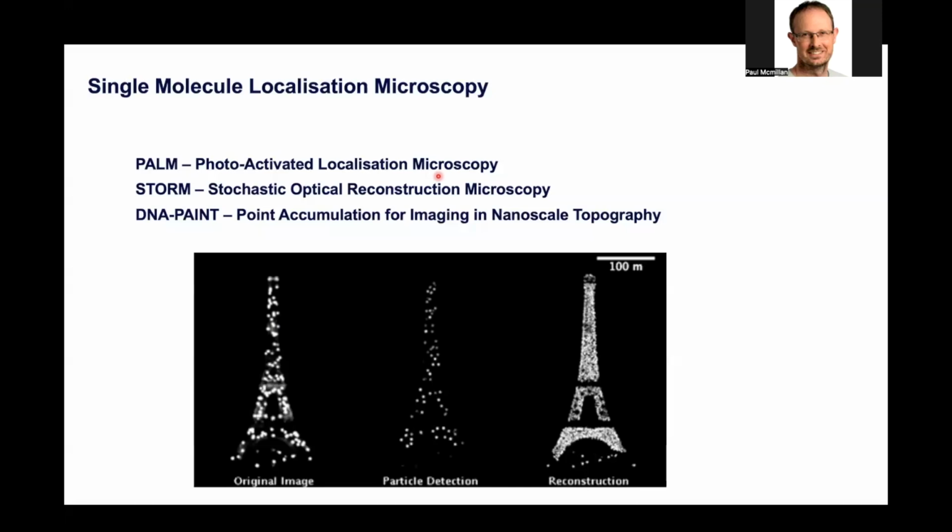In the case of photo switching, we can use an ultraviolet laser to convert a few molecules from emitting in a green into a red wavelength, and we measure those emissions coming through in the red wavelengths as the blinks. For STORM, these are chemical, normally antibody-based dyes. Again, we're using high reducing power, high laser power to push most of those fluorophores into a long-lived off state. Only a few of those will return down to the ground state so they can go through fluorescence and emit, and we get that blinking effect that way.